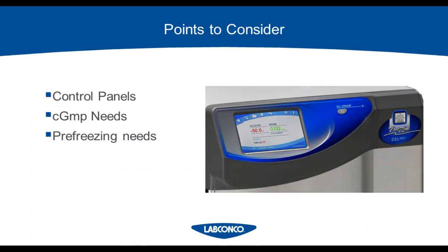Additional things to keep in mind when selecting a freeze dryer. What kind of controls does your freeze dryer need? What do you need to get the appropriate data and results from your run? Do you need your freeze dryer to meet CGMP standards? Do you need a freeze dryer with shelves to pre-freeze your samples?